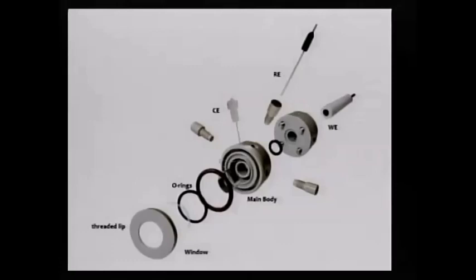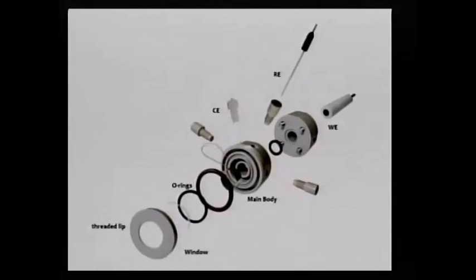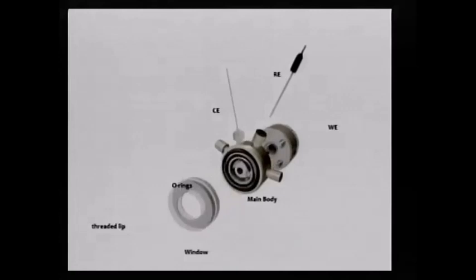So my colleague synthesized the semiconductors, and we put the semiconductor here at the surface of the vitreous carbon. And as you can see, it will be in front of the window. So you shine the electrode with the light you want, and then you catch the signal. And you can perform a lot of different experiments with this cell.